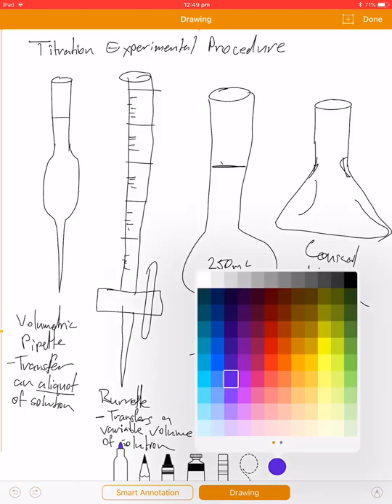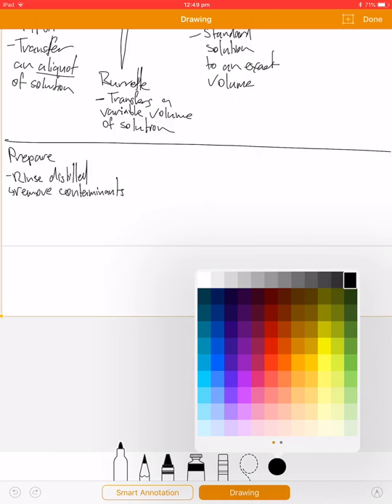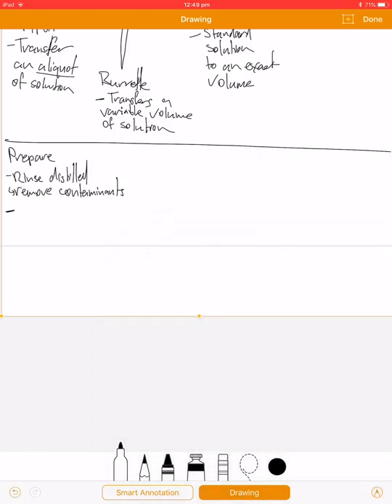Why not? Because if you've got residue water, it's going to lower the concentration, because your 20 mL or your 25 mL sample is now going to have some water in it, and therefore it's really going to be 24.2 mL because there's 0.8 mL of residue water there, for example. That is example numbers.